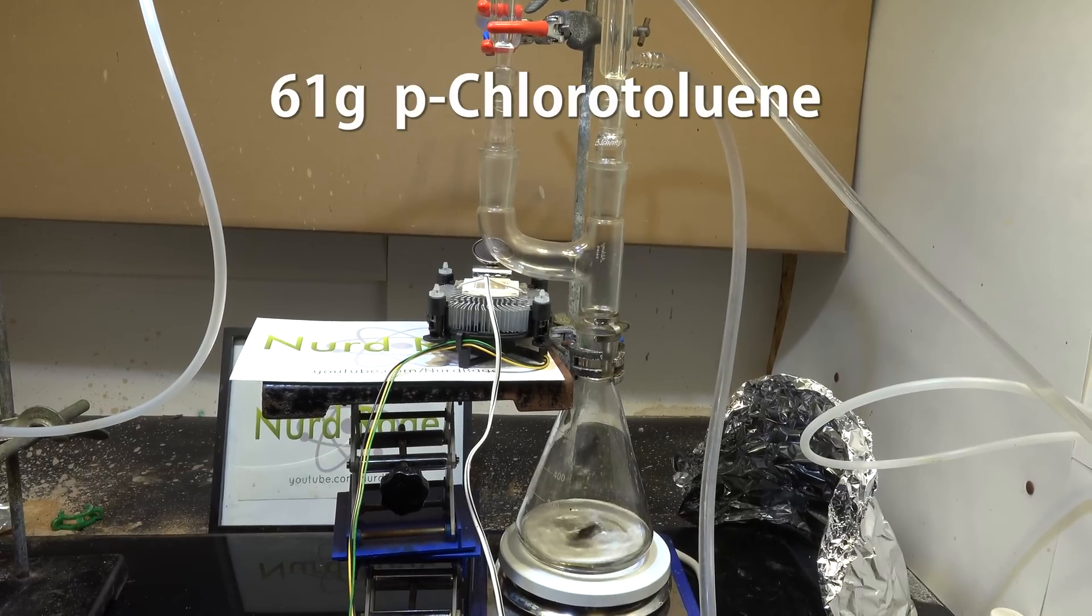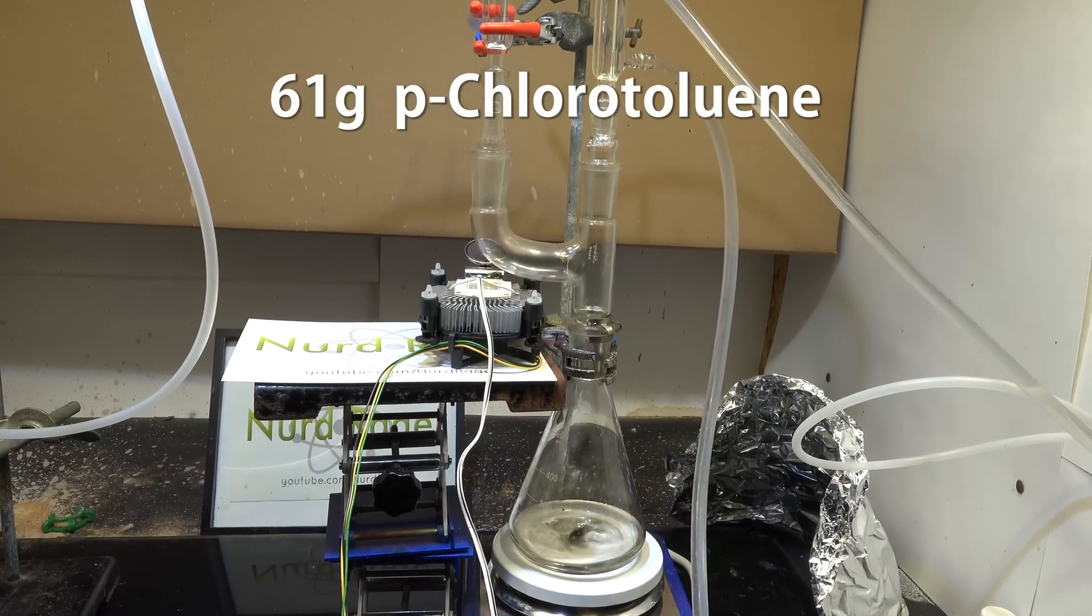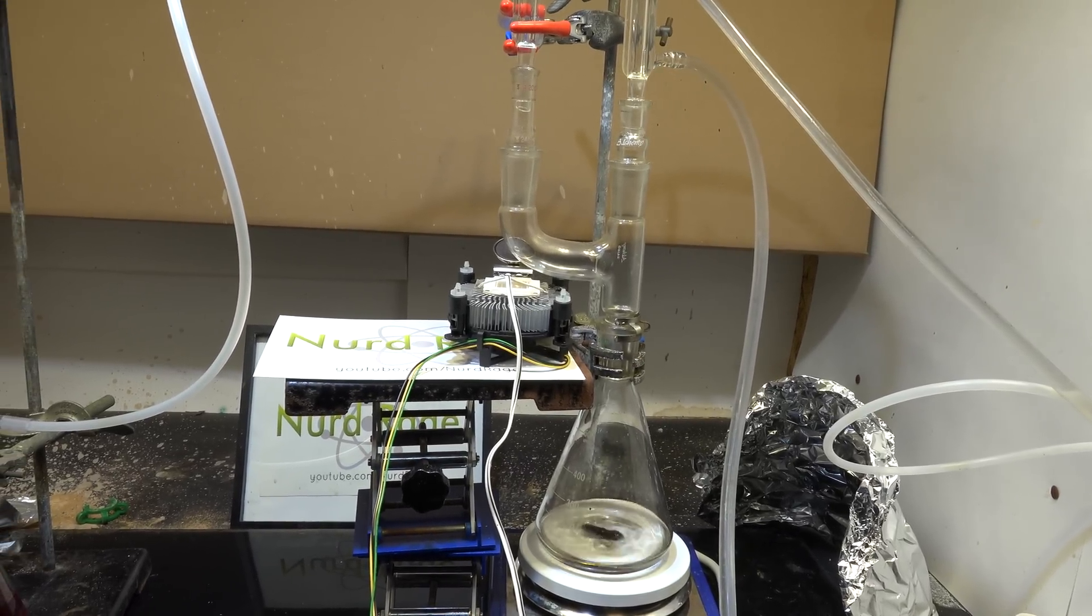First we have our sample of p-chlorotoluene in the Erlenmeyer flask. I've got about 61 grams. We're going to boil that until it refluxes.